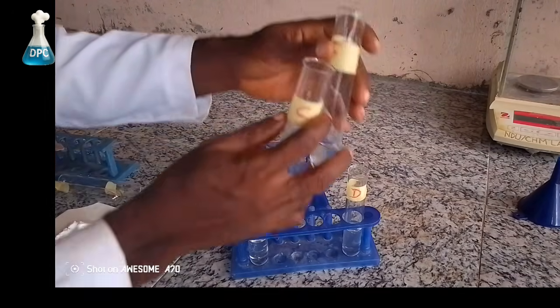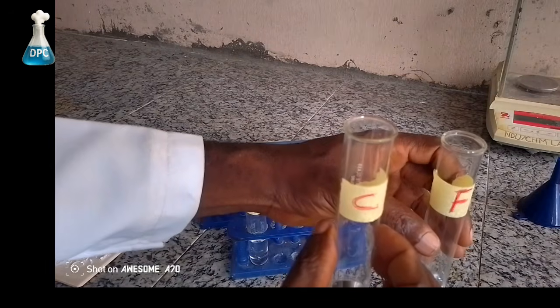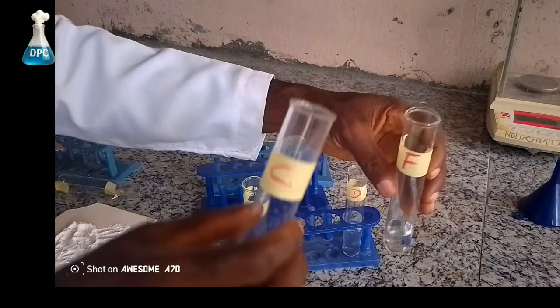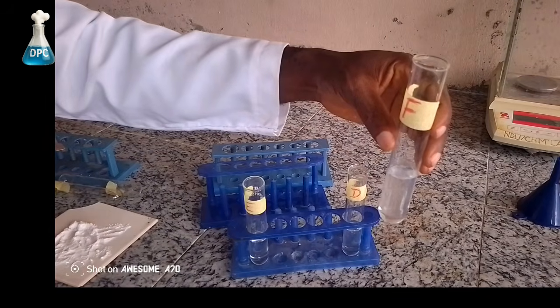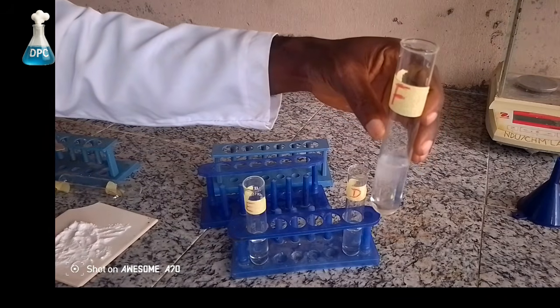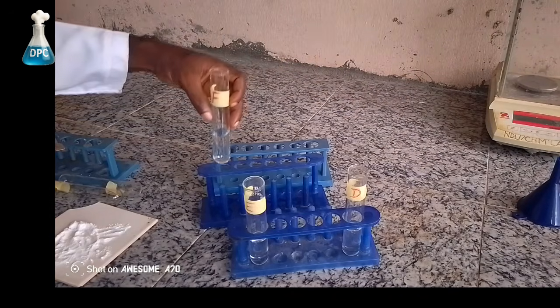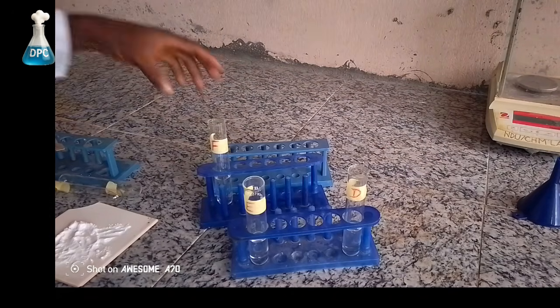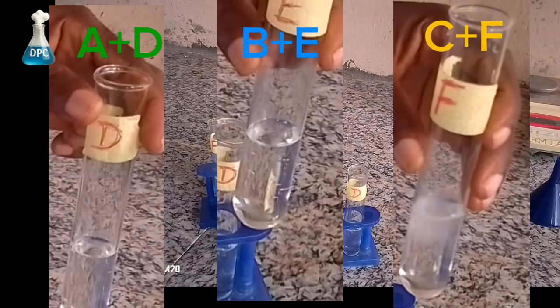Finally, we can turn solution C into solution F. Now these two are the least concentration. Observe. You can see the effervescence is very low. We can now make conclusion of the rate of the three reactions as we compare the three.